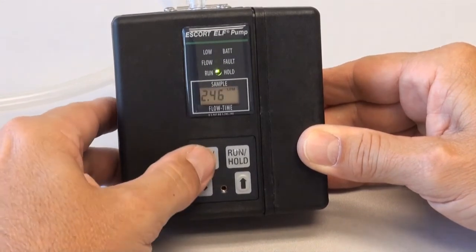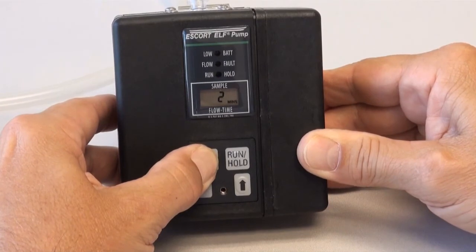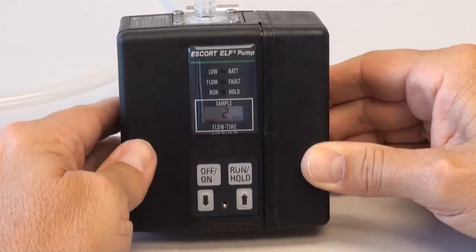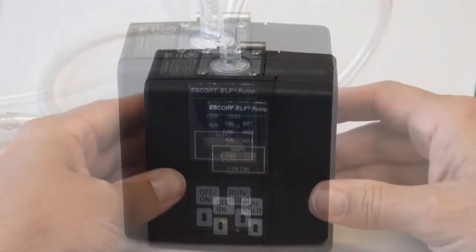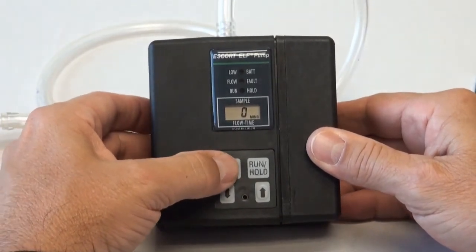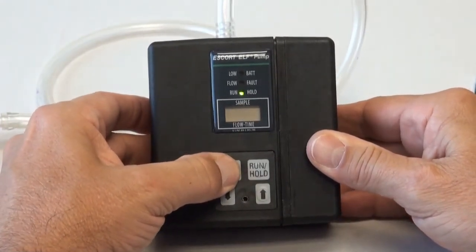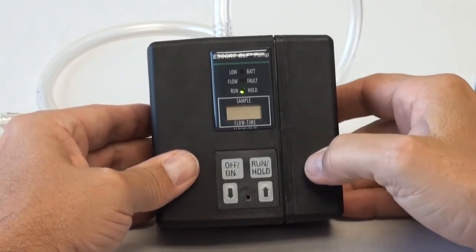Because the Escort Elf has an internal secondary calibration, the pump will only need to be calibrated to a primary standard once a month, or for coal mine dust sampling, MSHA requires recalibration every 200 hours. When you next turn on the pump, the total operation hours has been reset to zero and is displayed during the initial self-check sequence when the pump is turned on.